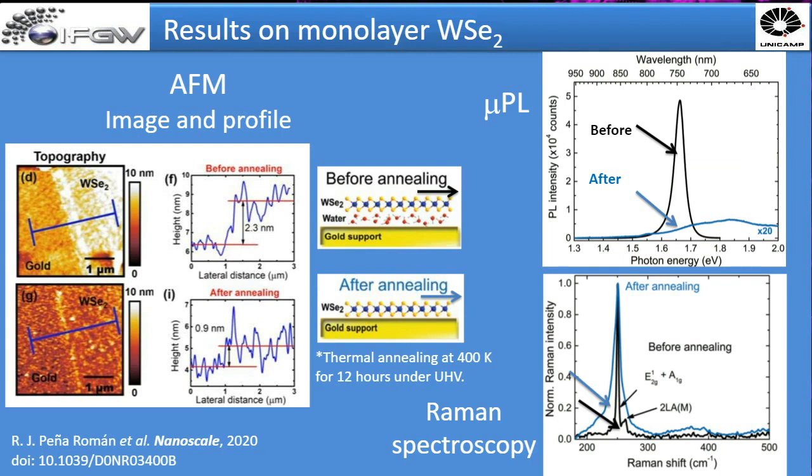And I also saw this in Raman, that is very strong evidence that the sample is not coupled before and is really coupled to the gold support afterwards. But I think that the most relevant or widespread evidence comes from the literature, because there are several studies that have aimed to make transfers in wet environments and have shown that the moisture in the air really is on several kinds of surfaces.